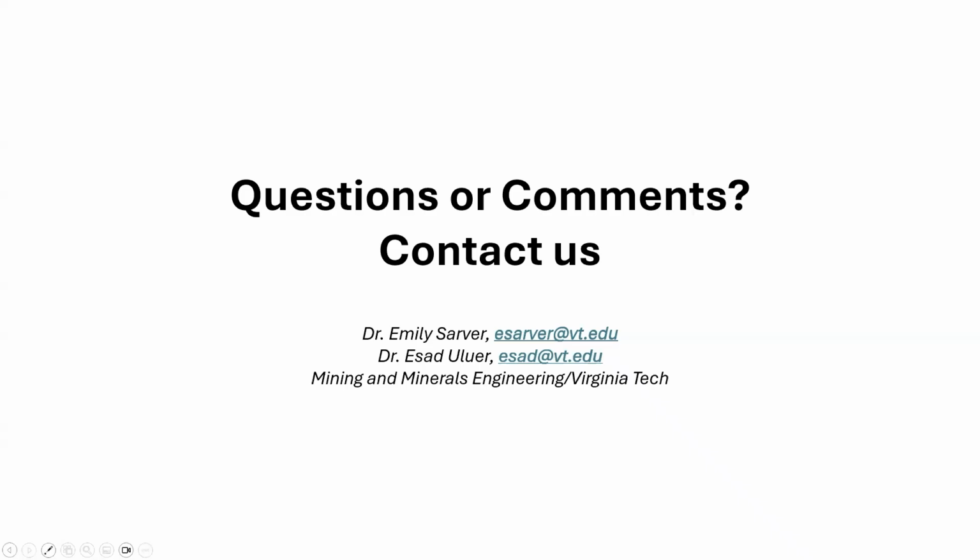We hope this presentation has been useful to demonstrate the rapid silica analysis method using a portable FTIR instrument on mine samples. We will share the Excel file with all the example tabs so that you can get help with those calculations.